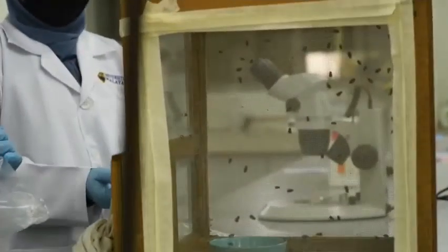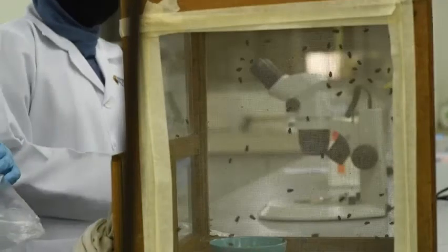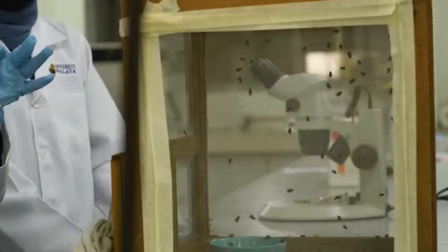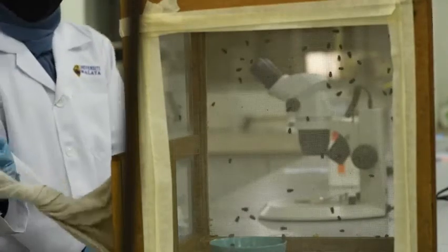For the method, we are going to focus on objective 1 first. The first step, we use a plastic bag and we remove 5 individuals of blowfly from the insect box.